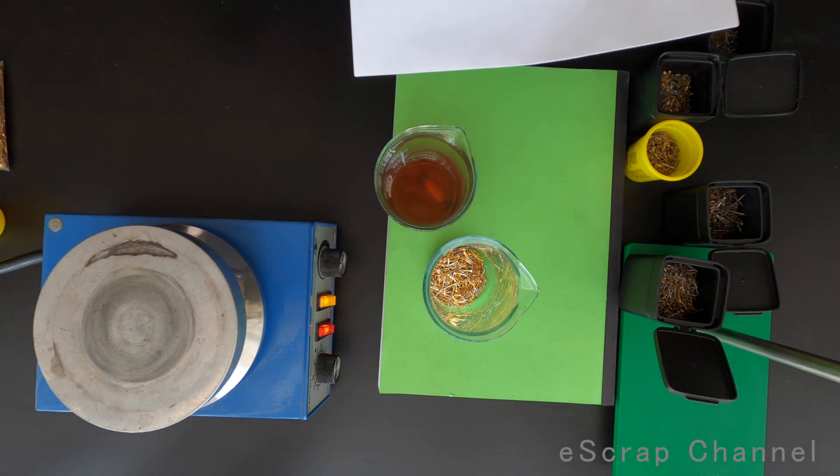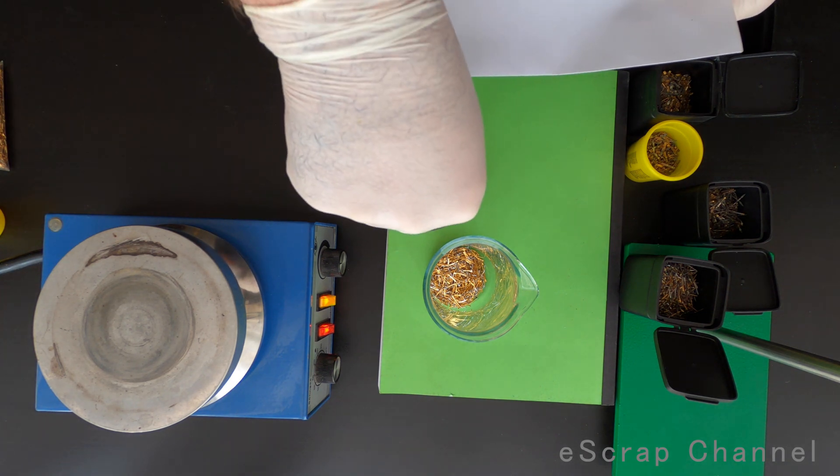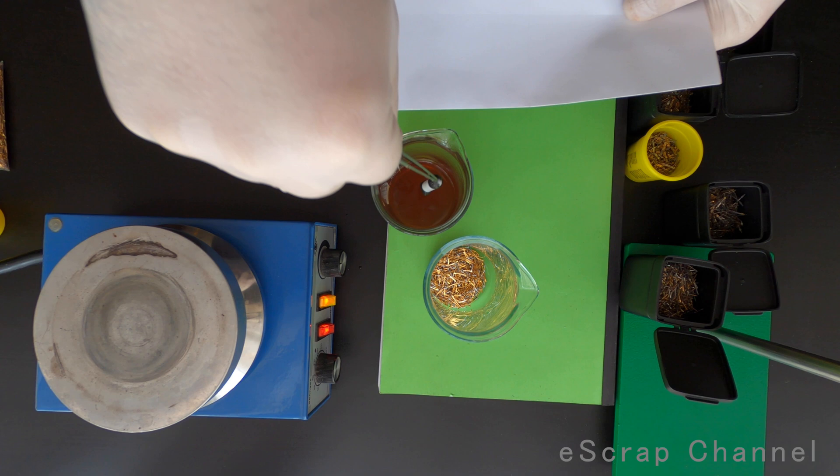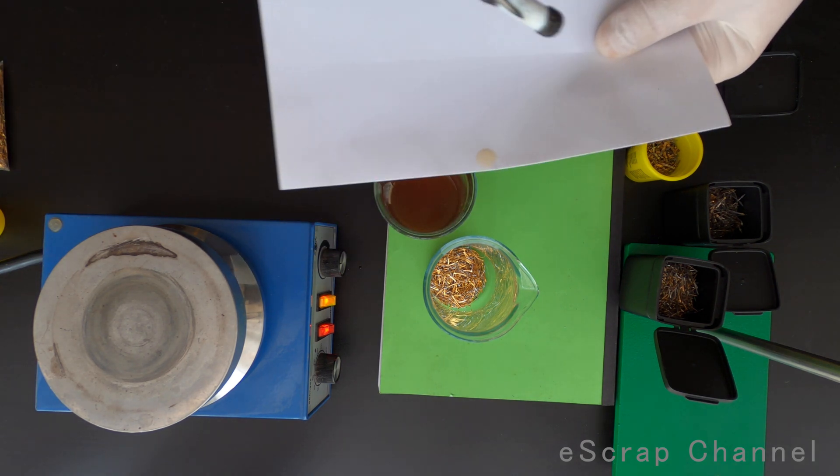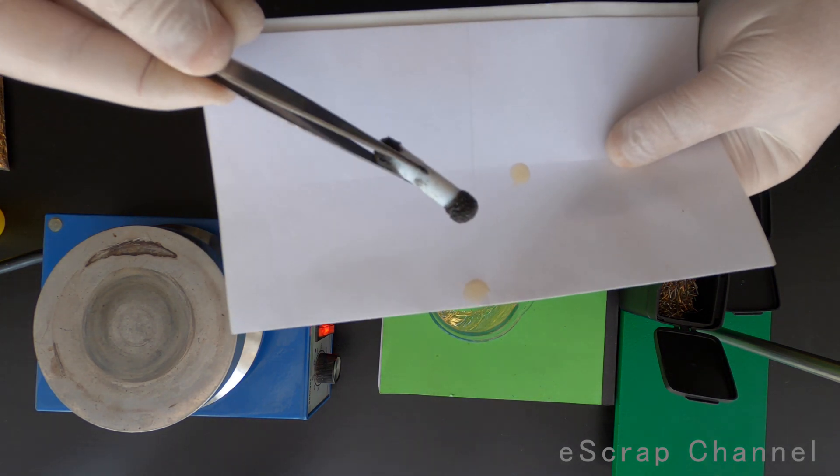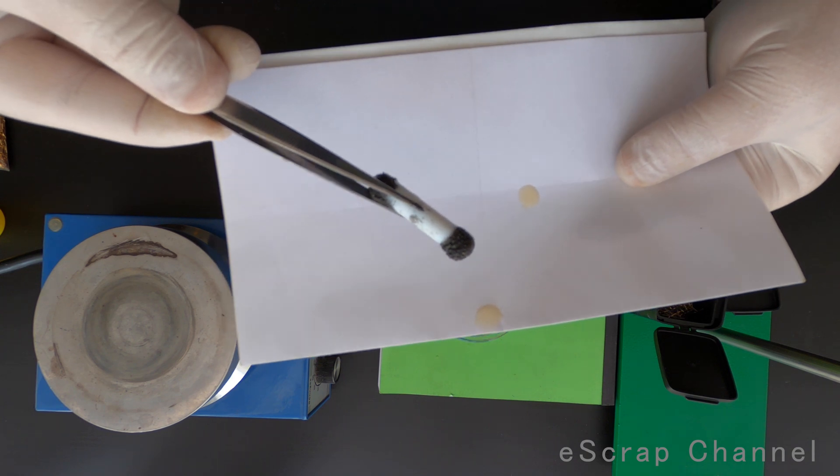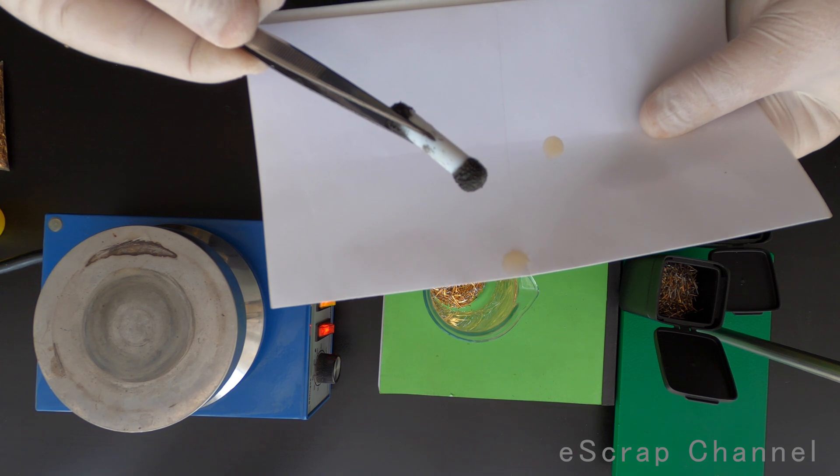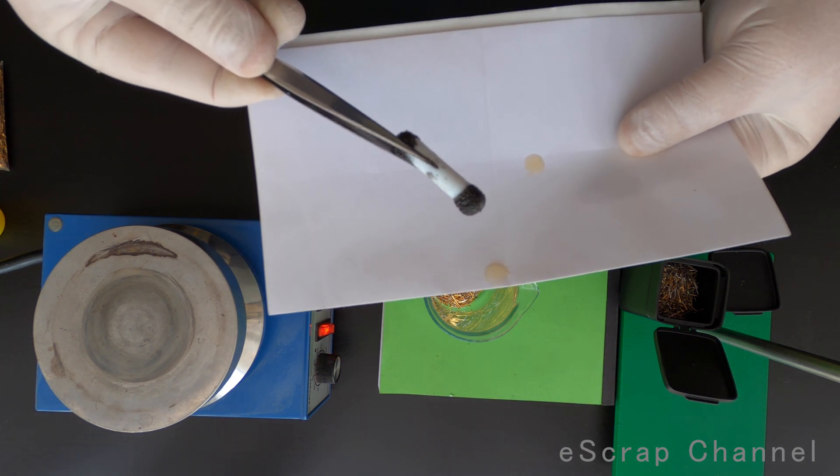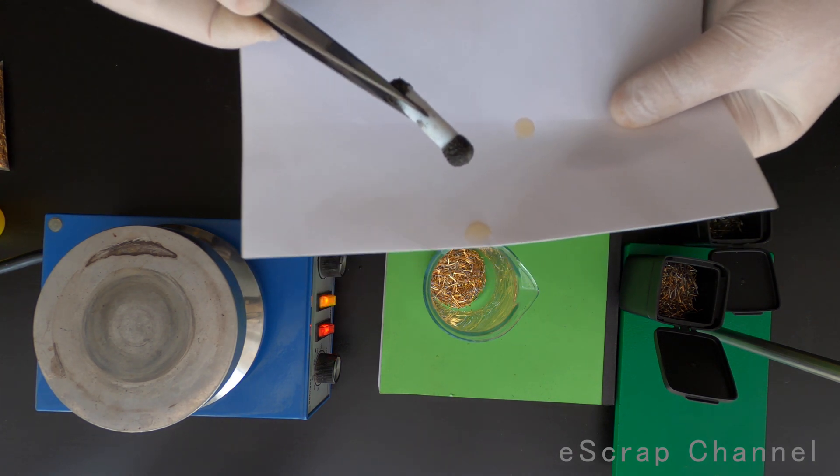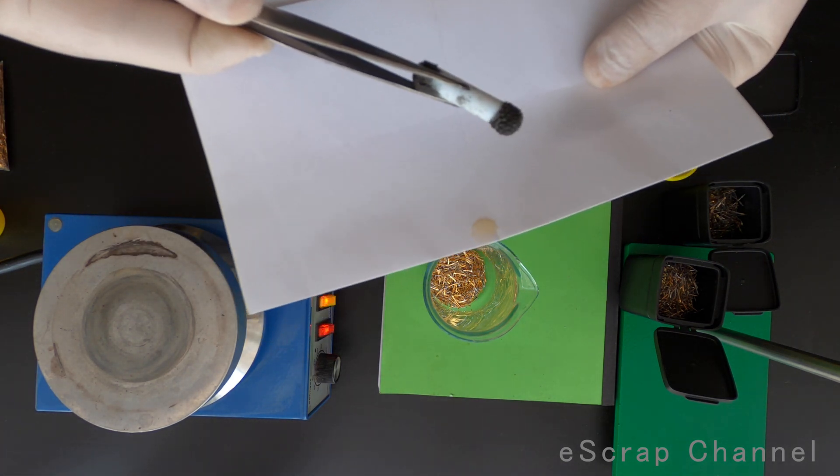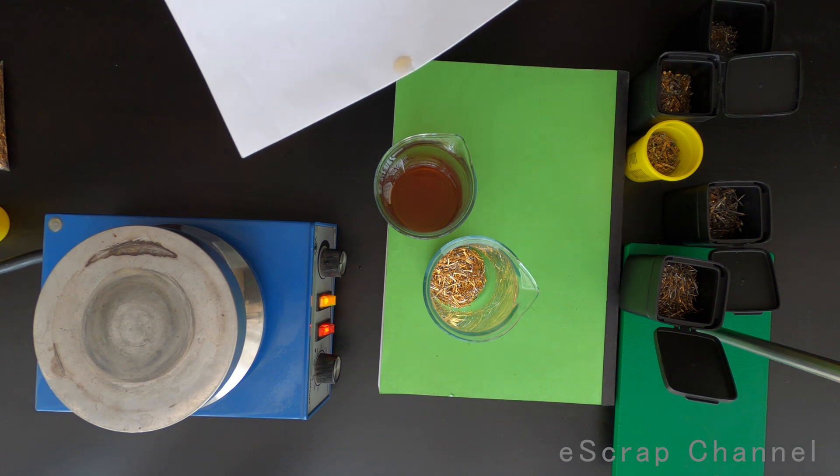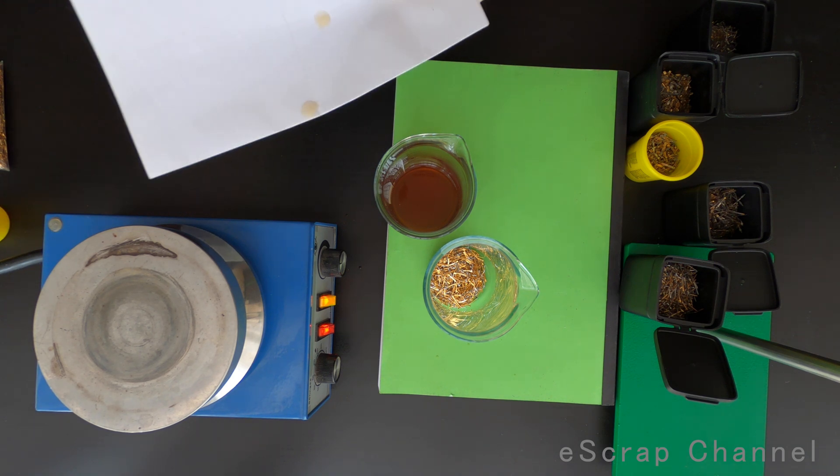It's a magnetic stirrer as I said. And if you take the stirrer, look at this. It's covered with some magnetic material. It was inside the solution and no matter how long you wait, this will not dissolve. So I will just remove my magnetic stirrer now.